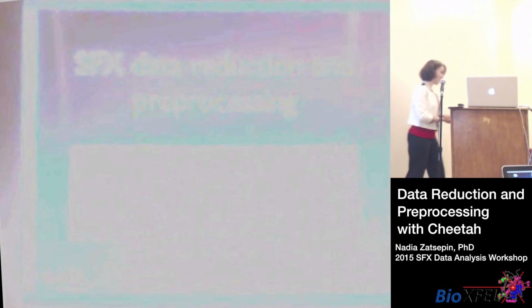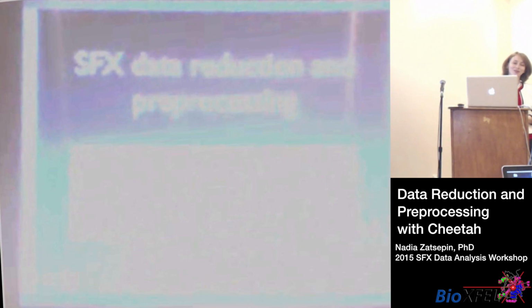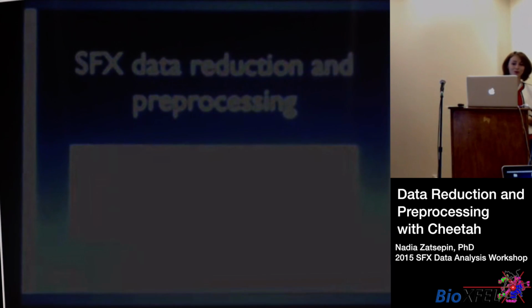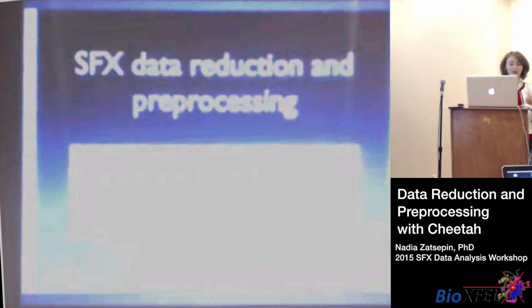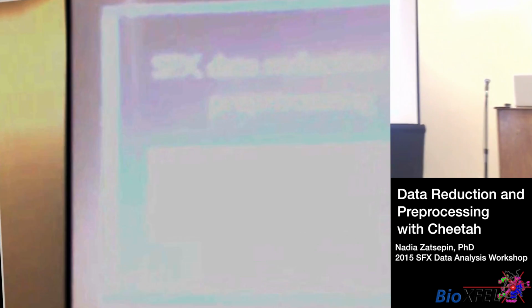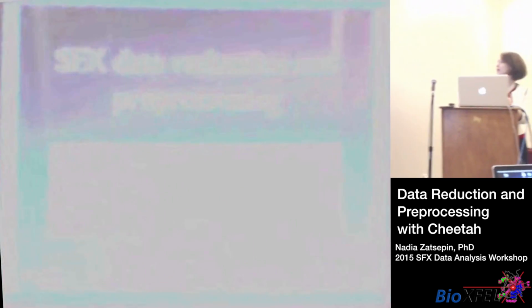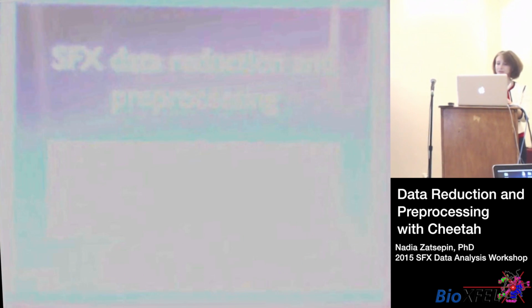It is free and open source online, but you don't need to install it. In fact, I would recommend you don't try, because it is heavily dependent on the software at LCLS. So we don't end up taking that raw data, but I'll get to that. Cheetah, CrystFEL and other software are all centrally installed at LCLS. There's also support at SLAC, and then we'll use XDS, CrystFEL, etc.